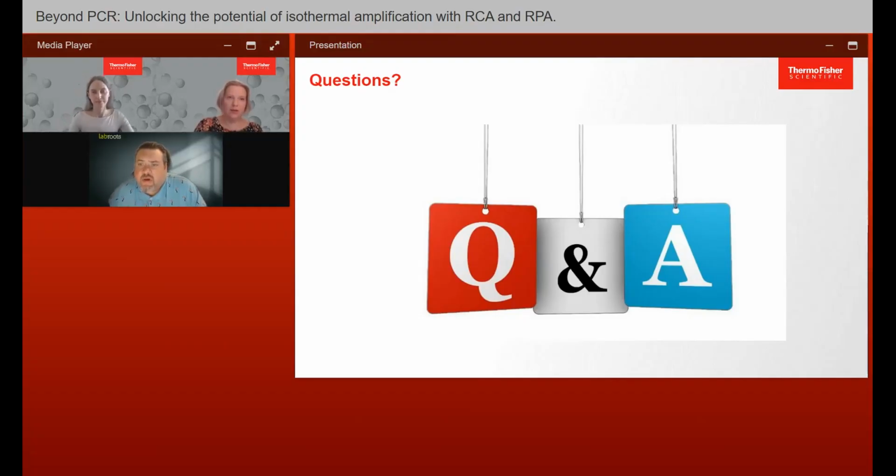All right. Another one. Of course, I can add, Raminta also commented about RCA, that it can be used for multiplexing. Yeah. Another one for Raminta.